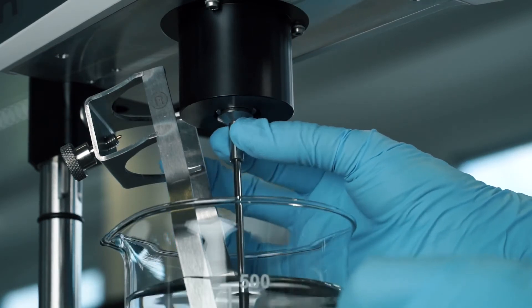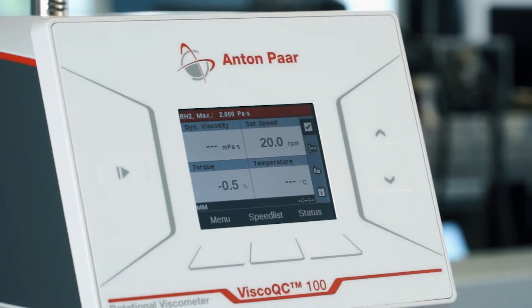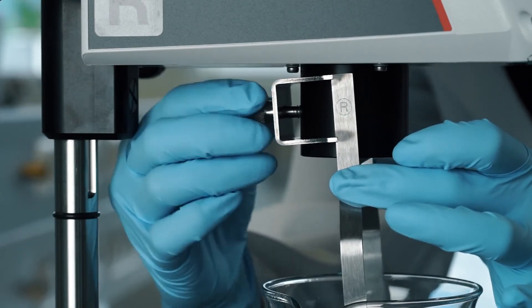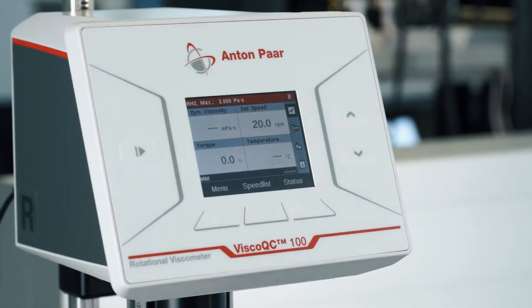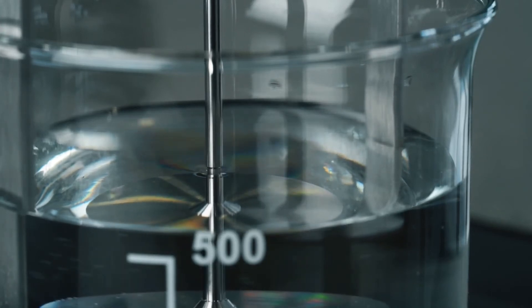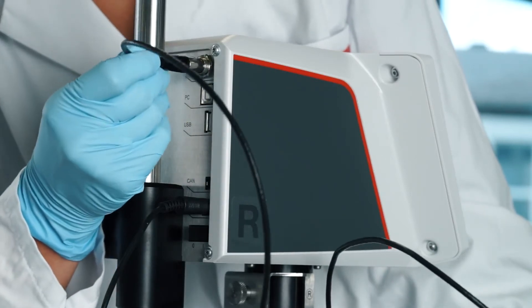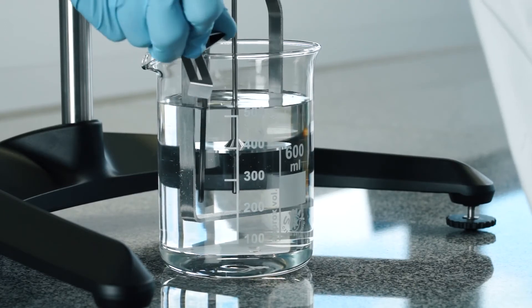After attaching your spindle, the Toolmaster feature automatically detects which spindle is in use. Fix your spindle guard with the screw on the backside of the flange. Make sure that the instrument is properly adjusted to the immersion mark of the attached spindle. If you want to use the optional PT100 temperature sensor, simply plug it in on the backside of the instrument and put it in your sample.